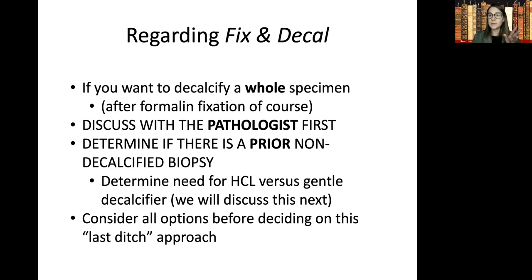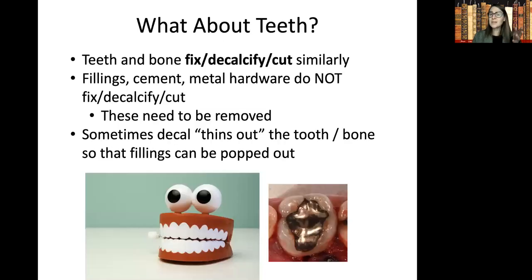But there are benefits to it. In this case, as I said, the teeth and the bone fixed similarly, decalcify at similar rates, cut very similarly. But the fillings, the cement, any metal hardware will not fix or decalcify or cut, right?